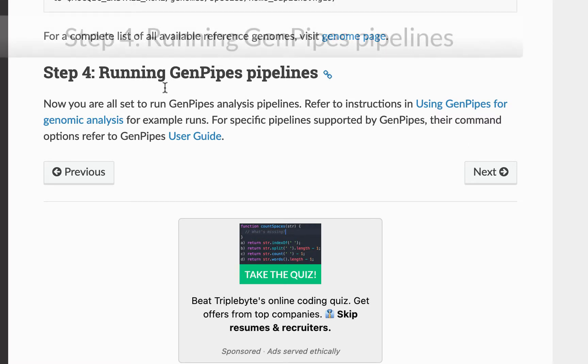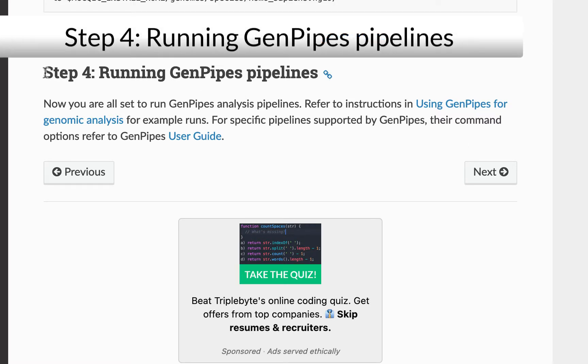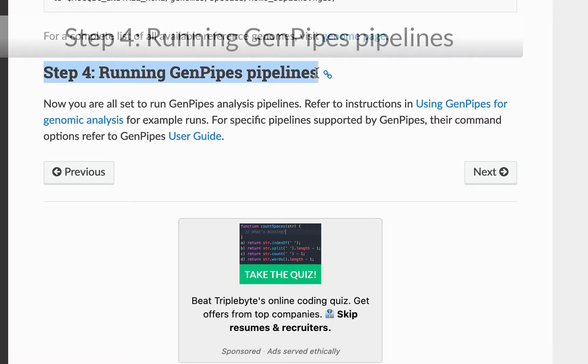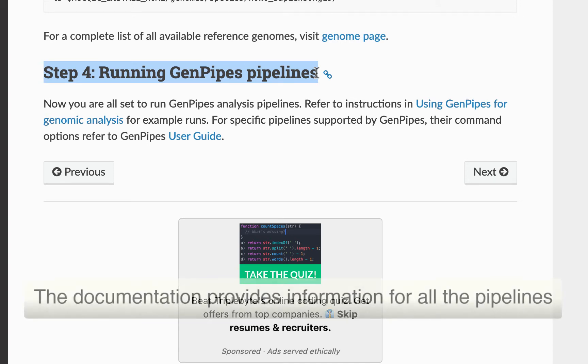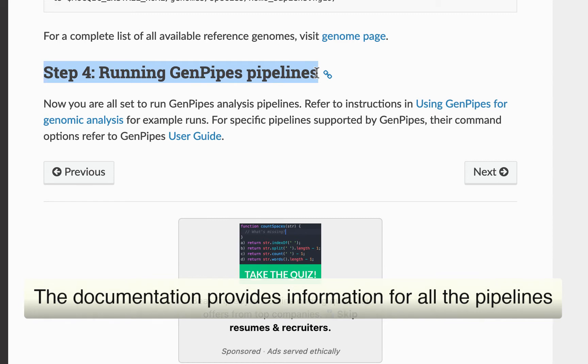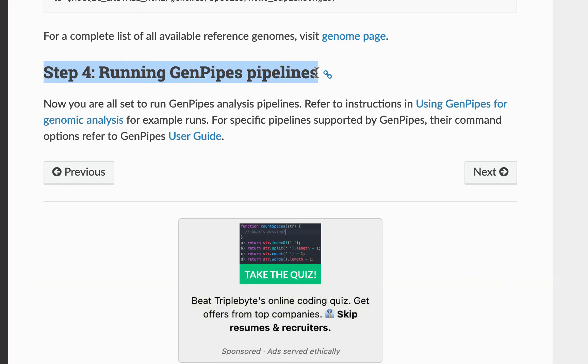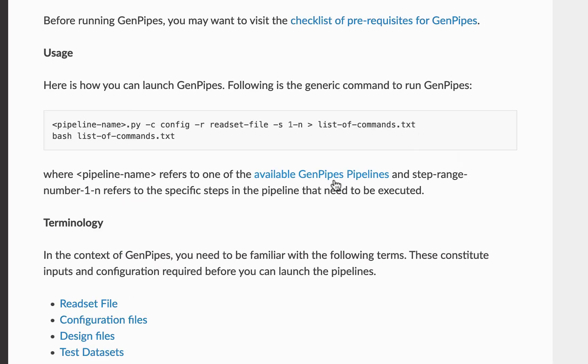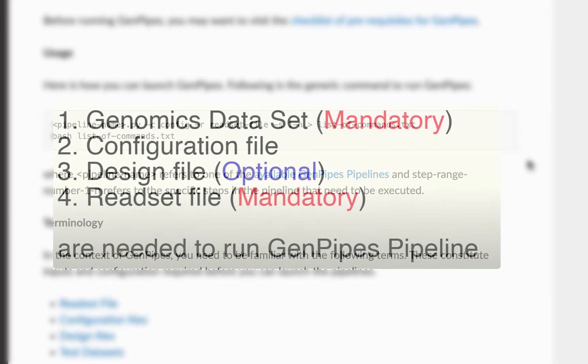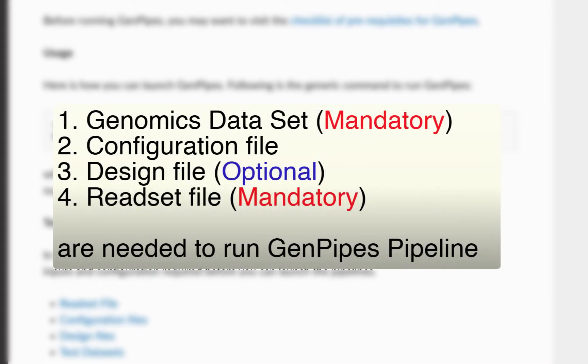Now, we can move on to step 4 and start running GenPipes. GenPipes currently have 13 different pipelines. You can find the information about all of these pipelines in the documentation. In order to run a GenPipes pipeline, you should have a genomics dataset, a configuration file, a design file and a readset file.